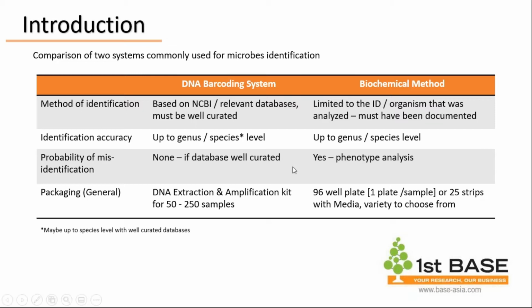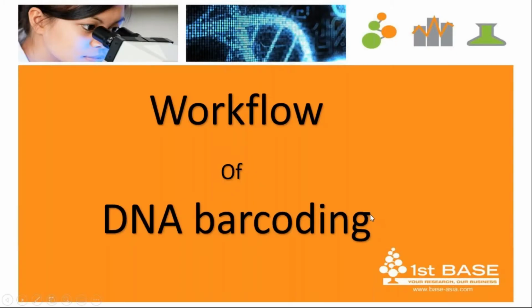So okay, and lastly is just for your information. The DNA barcoding system will usually come in a kit, and the biochemical test system usually comes in a 96-well plate or strip media. Okay, then we go into the workflow for DNA barcoding.